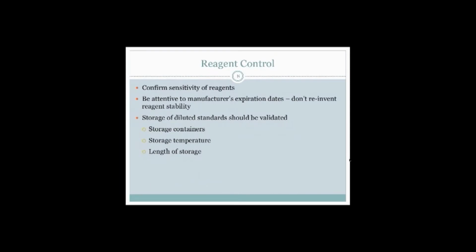In terms of the reagents, there is a requirement in all the pharmacopoeia to confirm the sensitivity of the reagents. And please be attentive to the manufacturer's expiration dates.